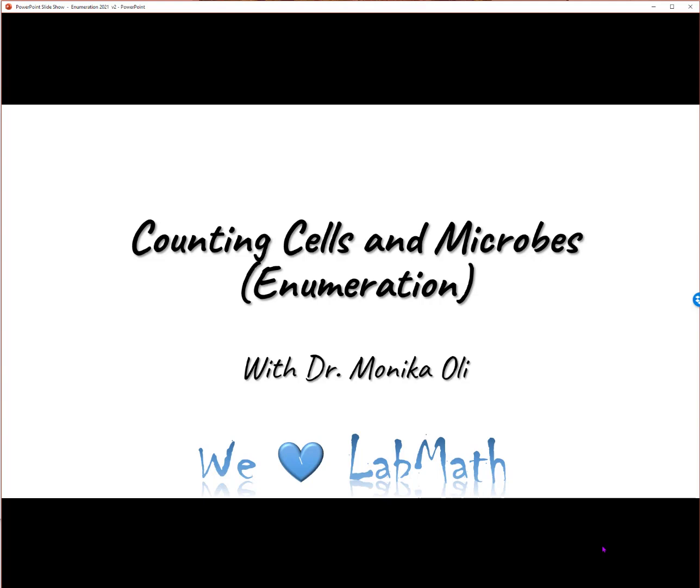Whether you work in the brewing industry trying to count yeast, whether you're in agriculture trying to count mycorrhiza, whether you are trying to develop a new vaccine, whether you're trying to develop new antibiotics, or any other way that you're trying to examine how things change over time in terms of growth, that's all how we enumerate microbes. And there are many different ways, really cool ways, lots of modern ways. But I'll show you in this little video 3 different ways of how we explain to you how to count cells and microbes.